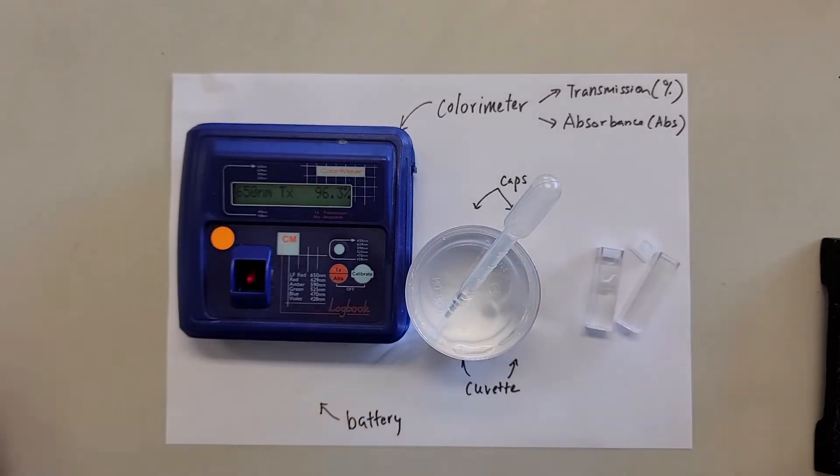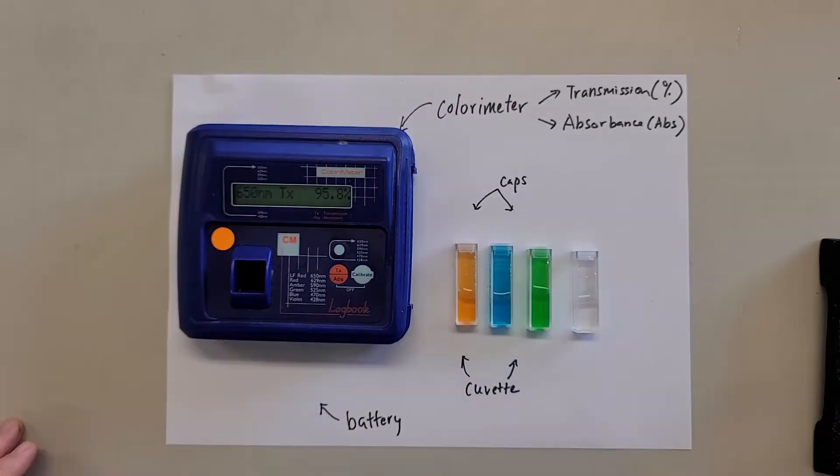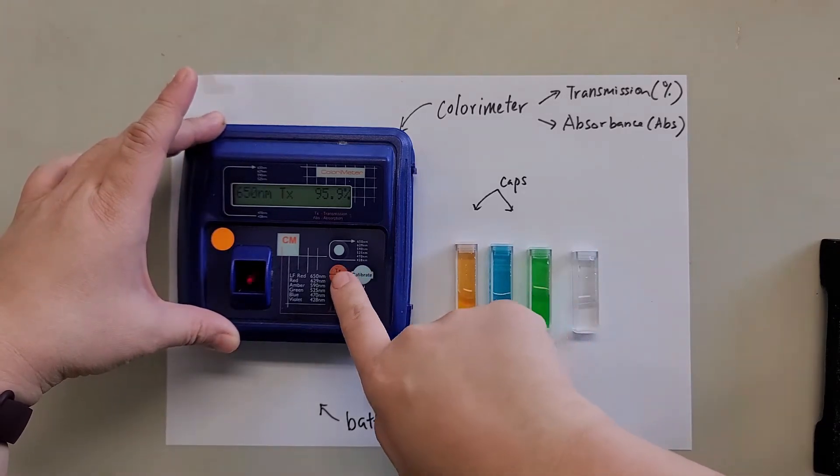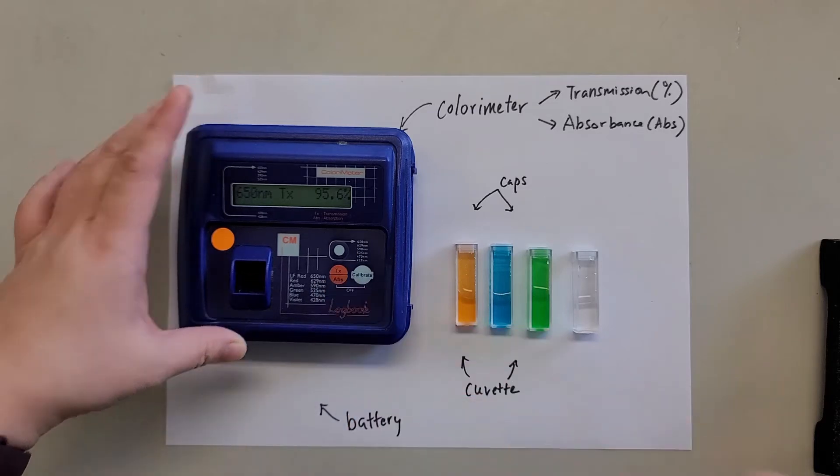Then the next part we need to teach you is how we decide which one we use for transmittance, which one we use for absorbance. So let's talk about absorbance first. I have prepared some colored solutions. Generally speaking, for colored solutions we will use absorbance. So first thing first, we need to change the function to absorbance first.